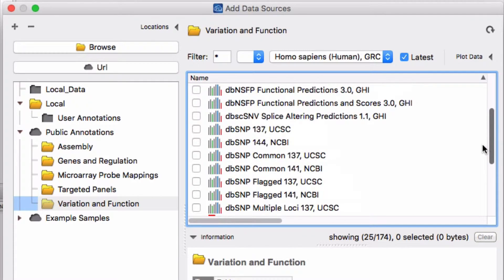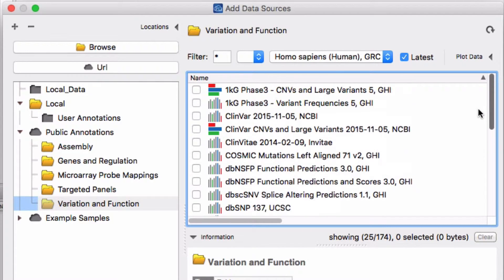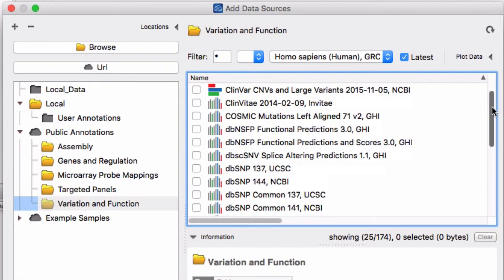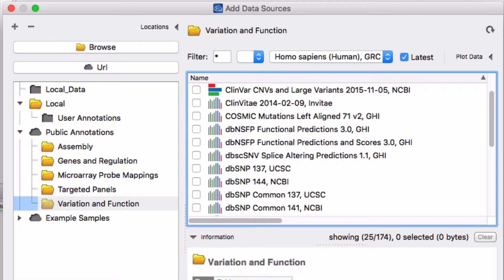There are several versions of DBSNP. Besides DBSNP, there are many other useful annotation tracks here. We will use these tracks to help us interpret genetic data.